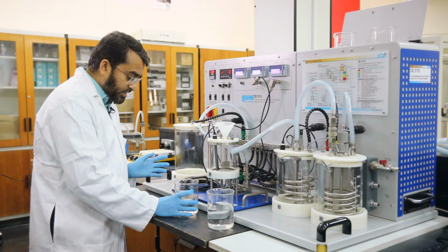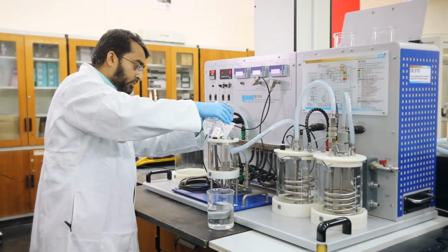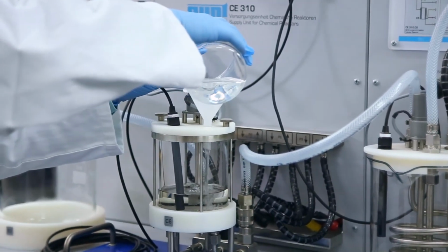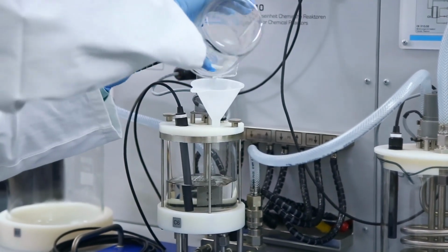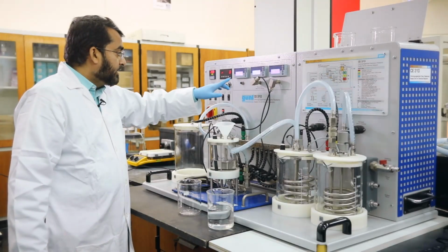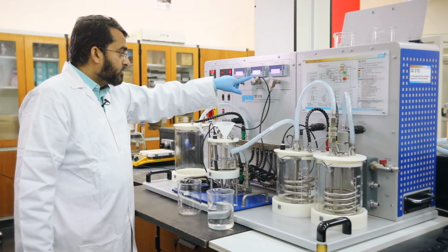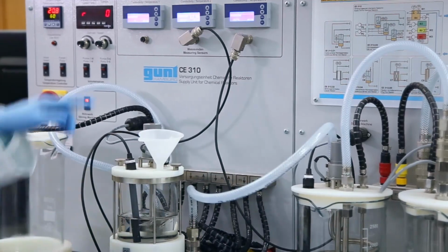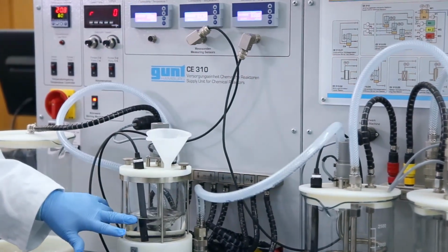So this is sodium hydroxide. I will add this first in the reactor. Let me start the stirrer, and now you can see the conductivity value is rising, because sodium hydroxide is conductive, and it will become constant with this concentration.